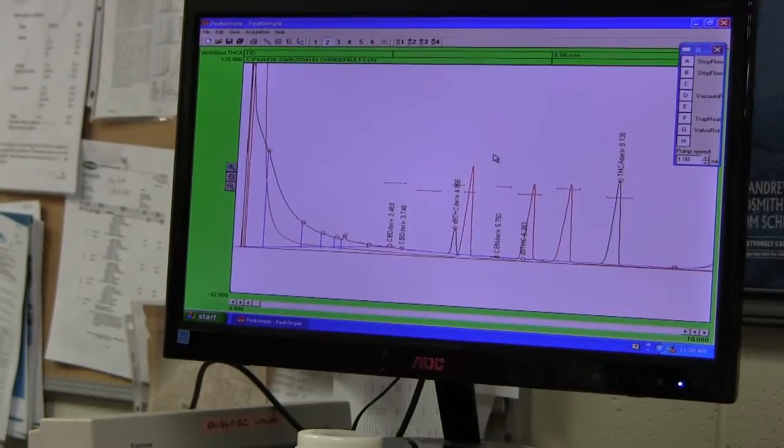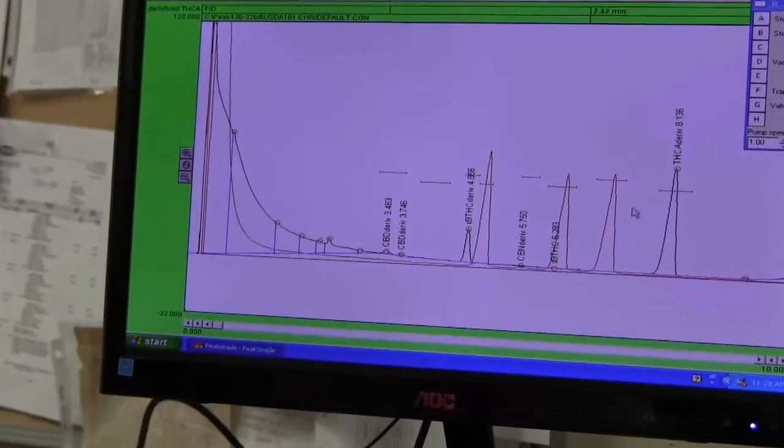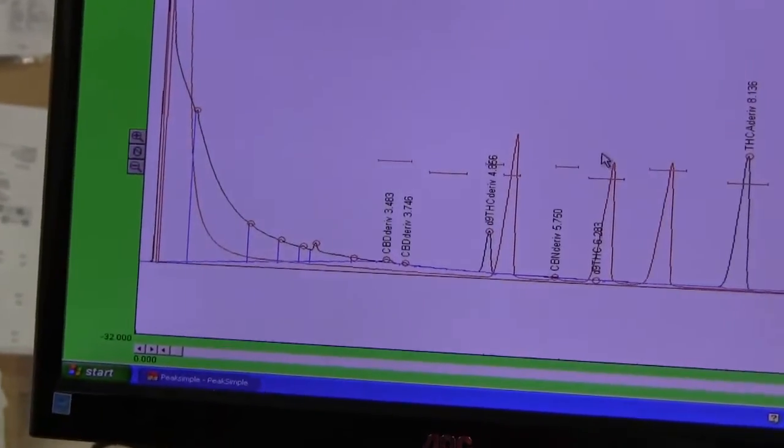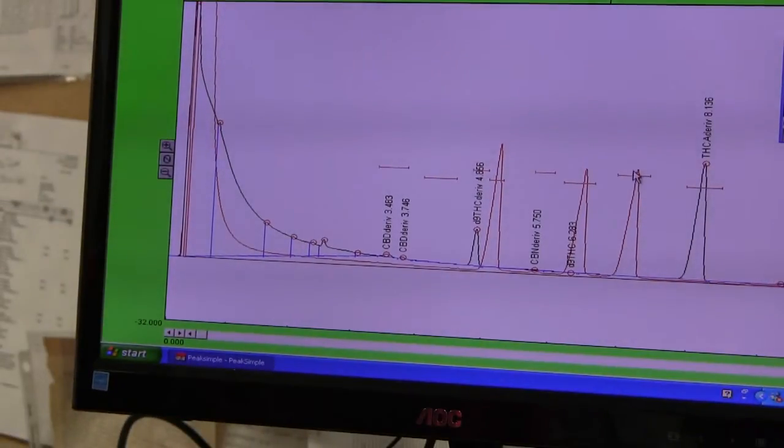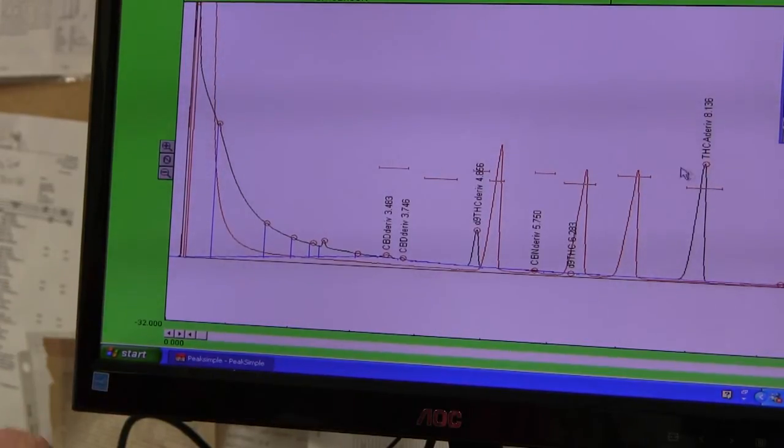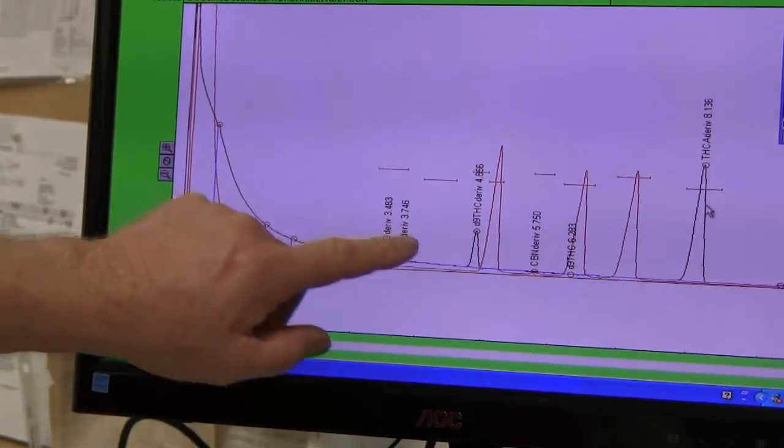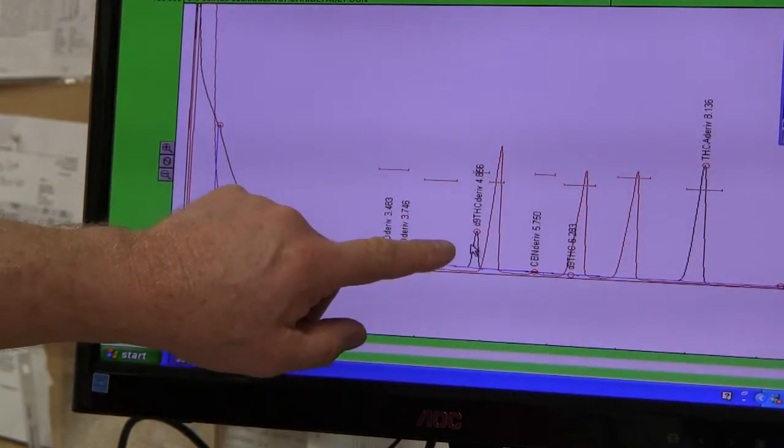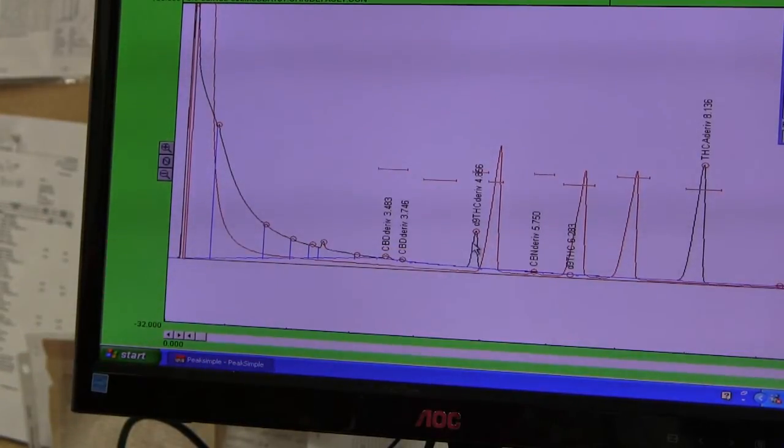So now we inject the derivatized THCA peak. And notice now that instead of coming out at the time of decarboxylated delta-9, the THCA peak comes out well after the CBN peak. There's a separate peak at the end of the chromatogram. This particular THCA standard has apparently decarboxylated somewhat in storage because along with the THCA peak, the derivatized THCA peak, we also see a smaller peak that comes out at the time for derivatized delta-9 THC.